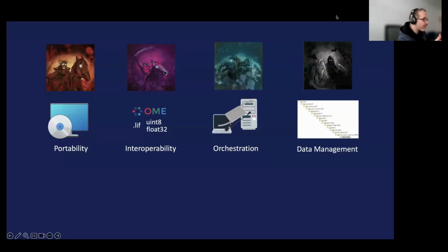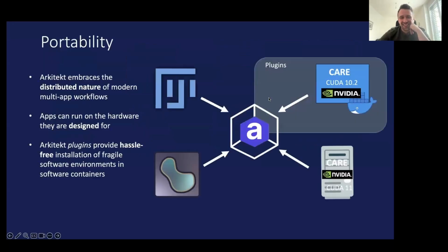And for example, as Clément asked about Conda environments, Napari is sometimes more for simple plugin installation, because if you want to put in multiple plugins, you will have problems. So in the idea of Arkitekt, you can put many Napari environments and tell Arkitekt to do this.